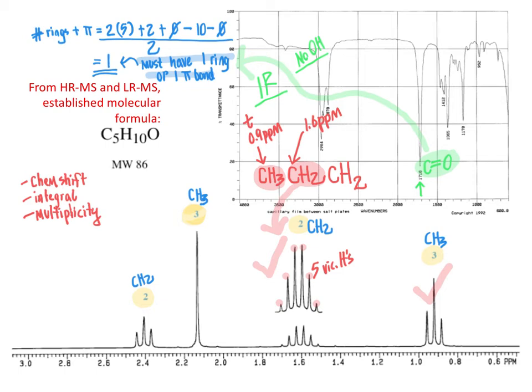So therefore, I infer that this CH2 group, the next one in the chain, has to correspond by process of elimination to our group that is at 2.4 ppm. So I'm going to put a check mark on the group that is at 2.4 ppm and label that in here as 2.4 ppm. Also, to check my work, I'm going to go back one step to this CH2 group in the middle here and label that with its multiplicity, which we said was the 6 peaks, which we call the sextet.